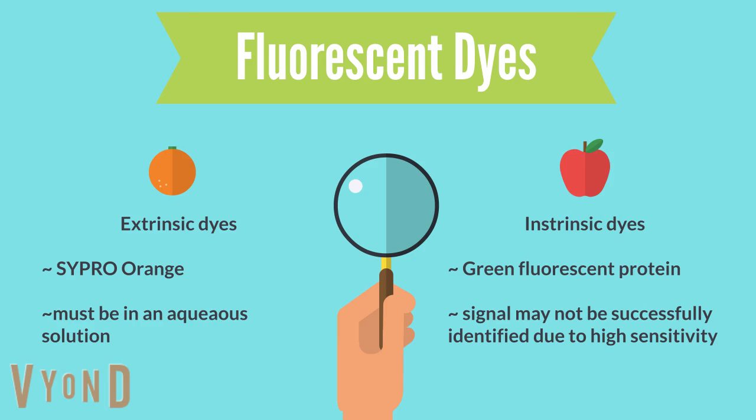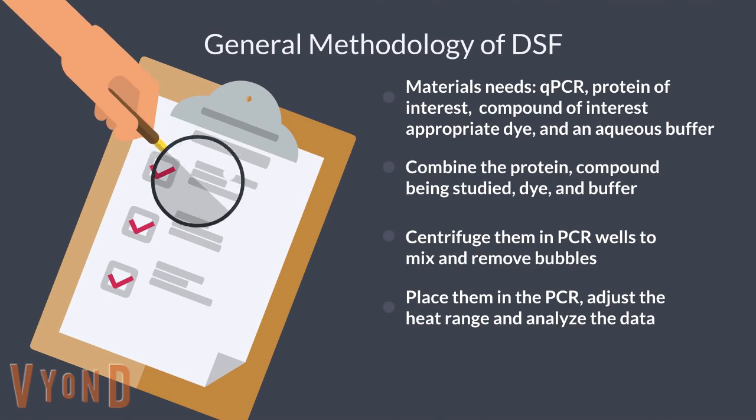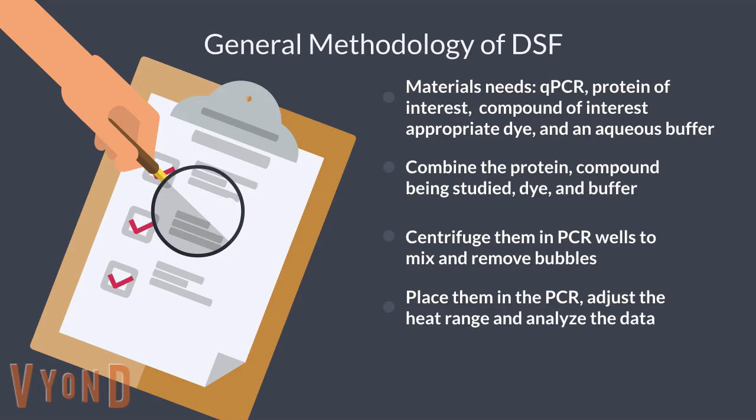An intrinsic dye example is called a GFP, which stands for green fluorescent protein tag. That tag is fused to your protein of interest, and the signal from this tag is recorded as its location changes based on the proximal location of it within the protein as it's unfolding. Unfortunately, this is a very sensitive approach, and the signal may not successfully be able to identify your protein due to the high sensitivity. The general methodology of DSF would require you to get all of your materials together.